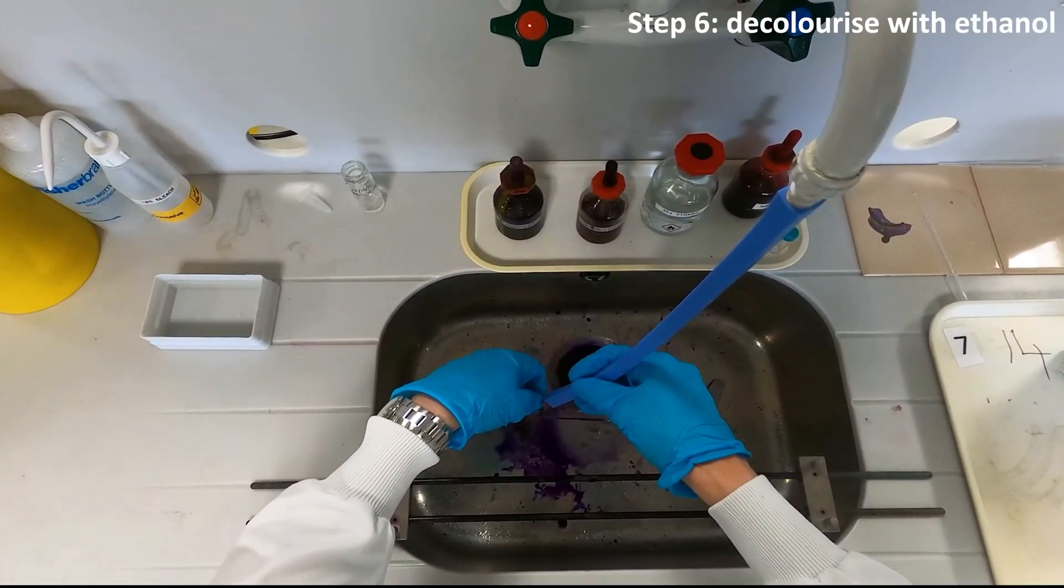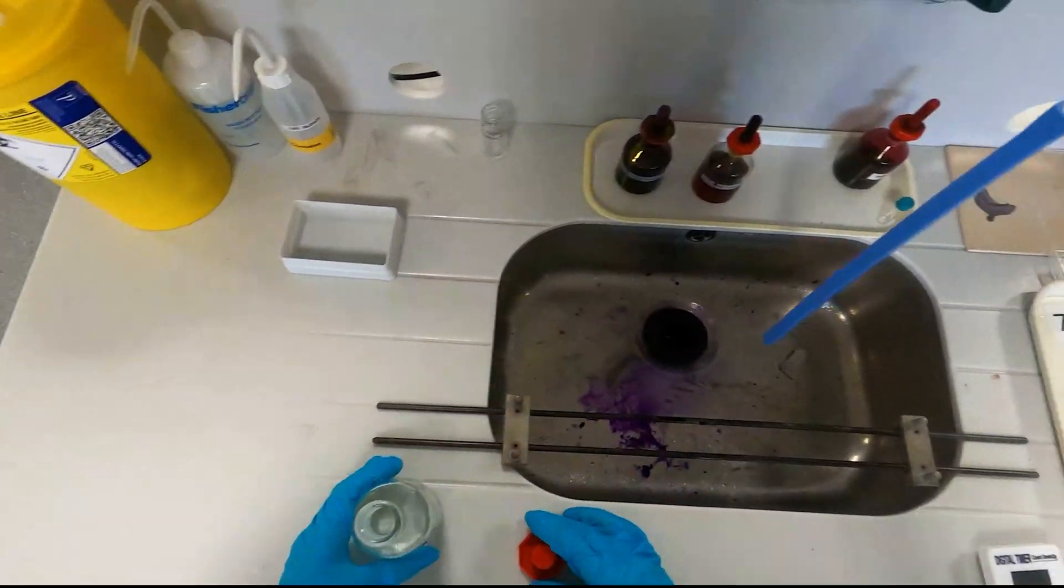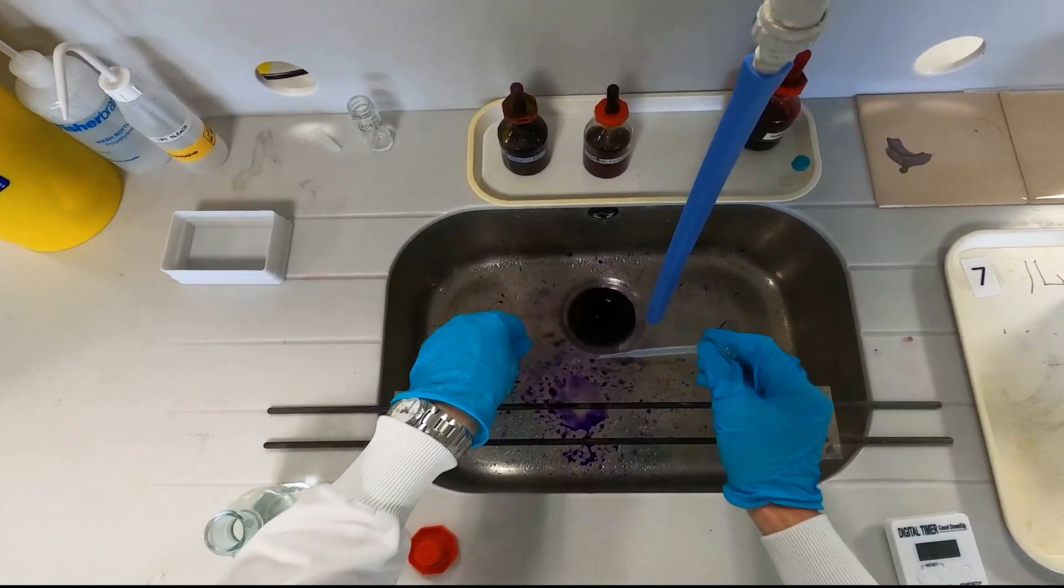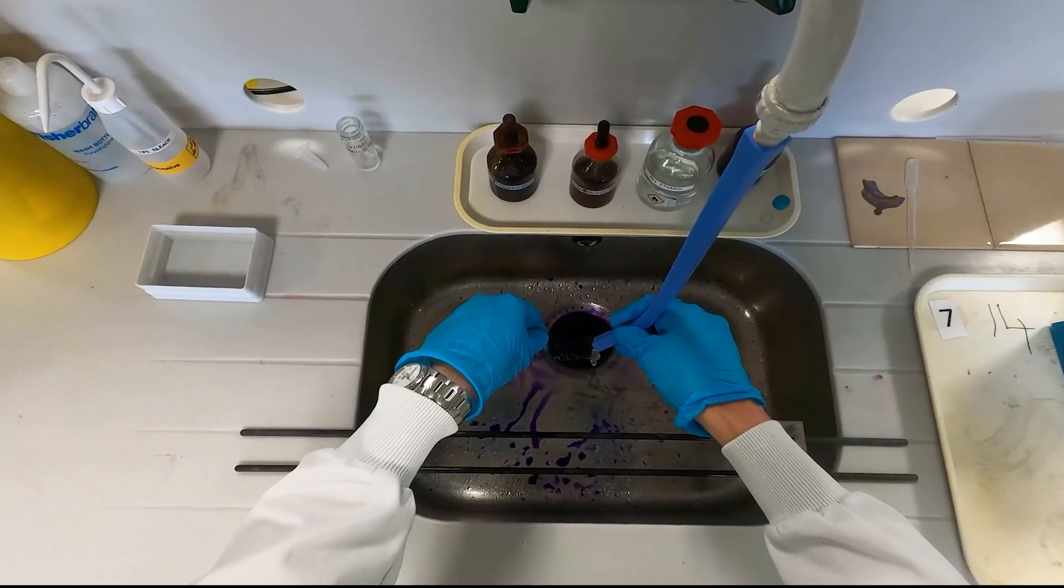Now it's time to decolorize with ethanol. This gets rid of any excess crystal violet still bound to the cells. Rinse the slide with ethanol until no more purple color runs off the slide. This should take around 10 seconds to do. Rinse under running water to get rid of any excess ethanol.